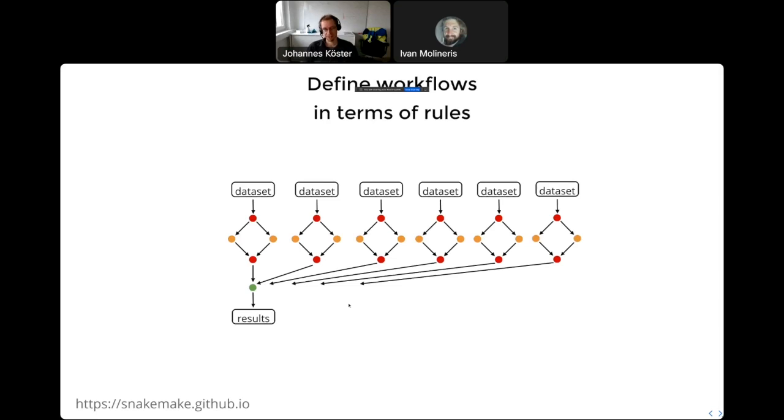And these final steps are often neglected by people who develop workflow management systems. So they care a lot, especially if you look into systems like Nextflow or CWL, but also many Snakemake workflows around. People care a lot about the primary analysis steps that do all the heavy lifting, but then the rest, until the final figures of the paper, is often conducted just by invoking a separate Jupyter notebook that creates 20 plots or whatever, does some final filter steps or data aggregation, and then you get basically your manuscript.